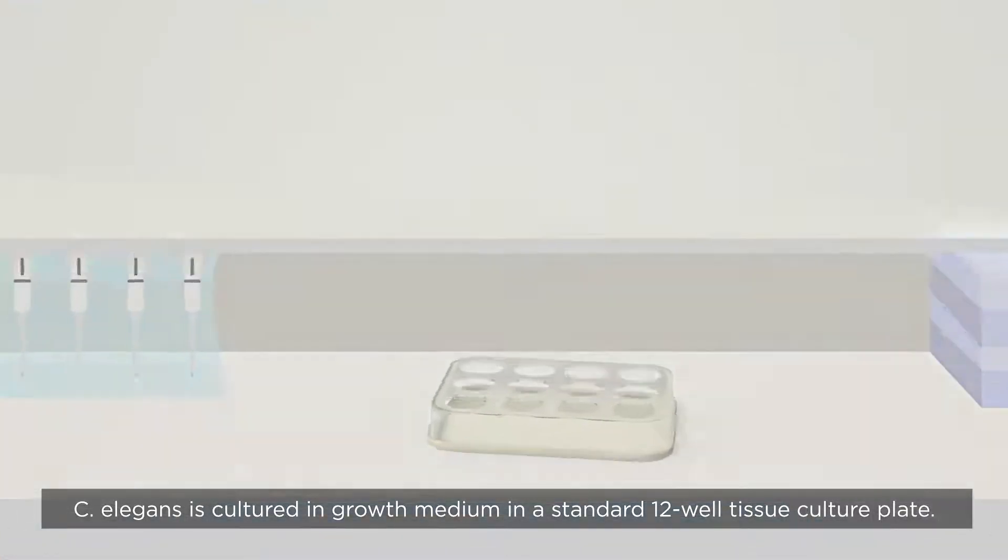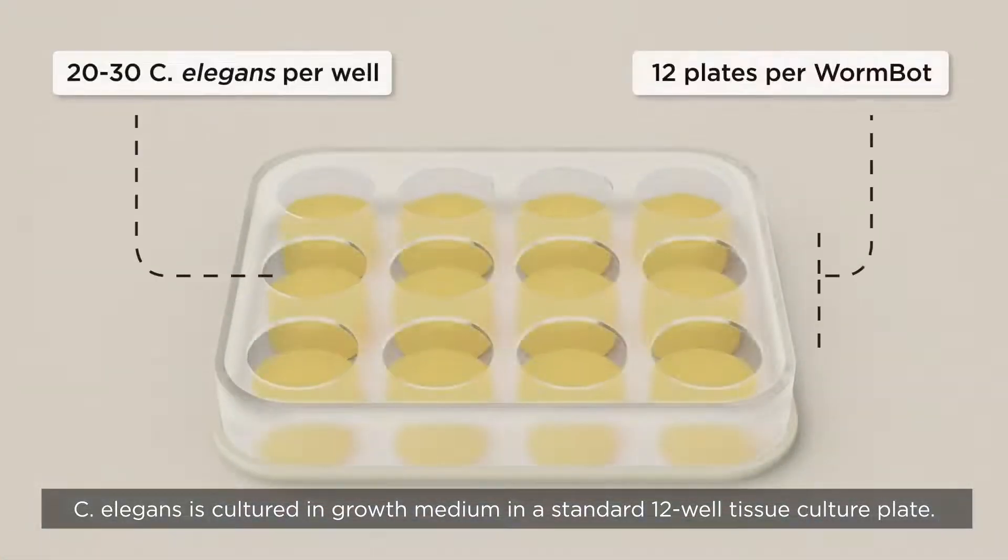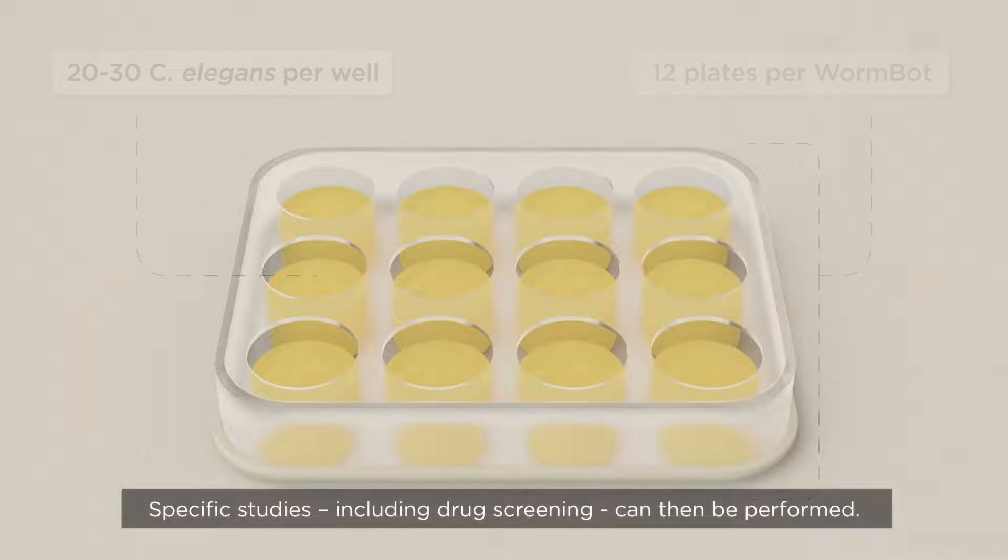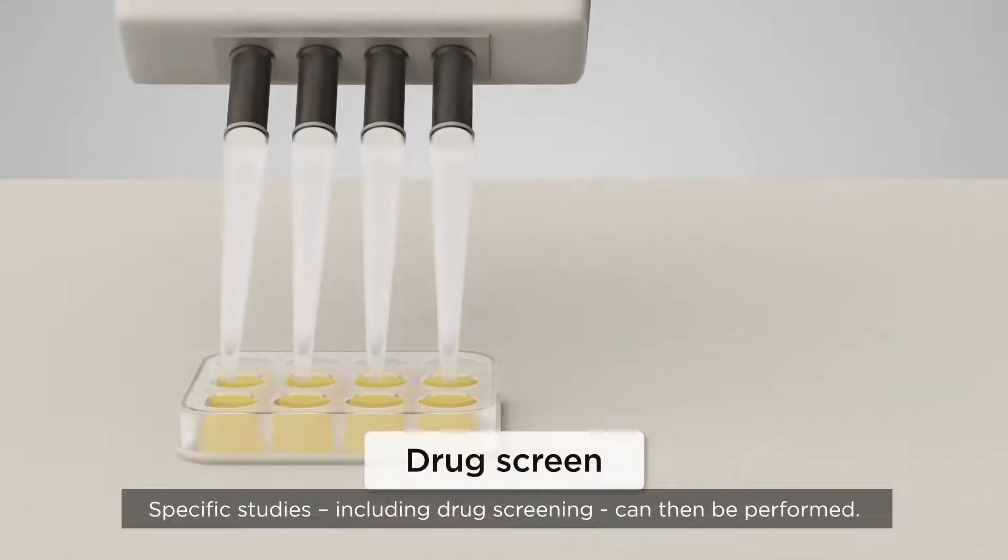C. elegans is cultured in growth medium in a standard 12-well tissue culture plate. Specific studies, including drug screening, can then be performed.